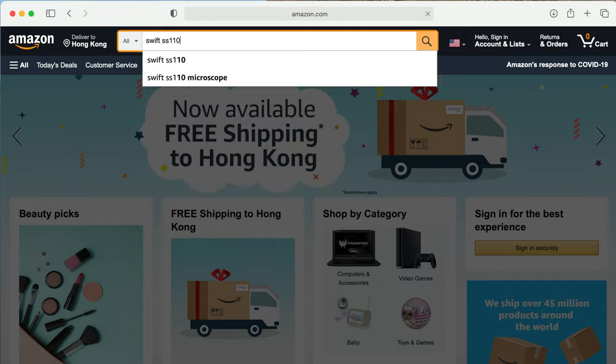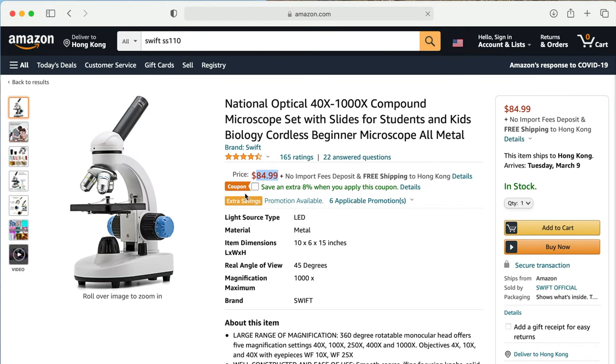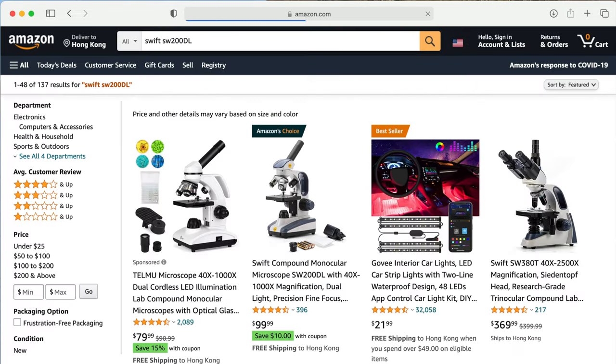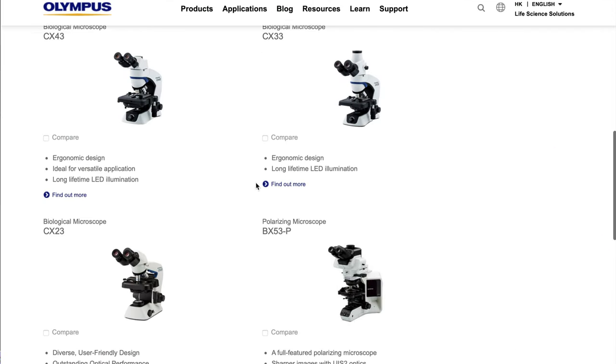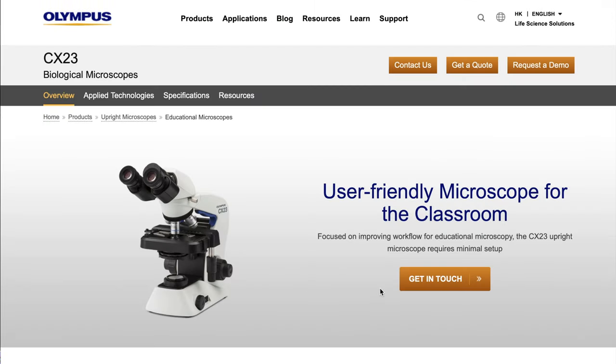For pricing, if we go to Amazon, we can see the Swift SS110 is priced around $84. The SW200DL costs right about $100. So for $15 more, you're getting a slightly better objective and one more lamp — maybe it's worth it. As for the Olympus CX-23, it costs about $1,000.